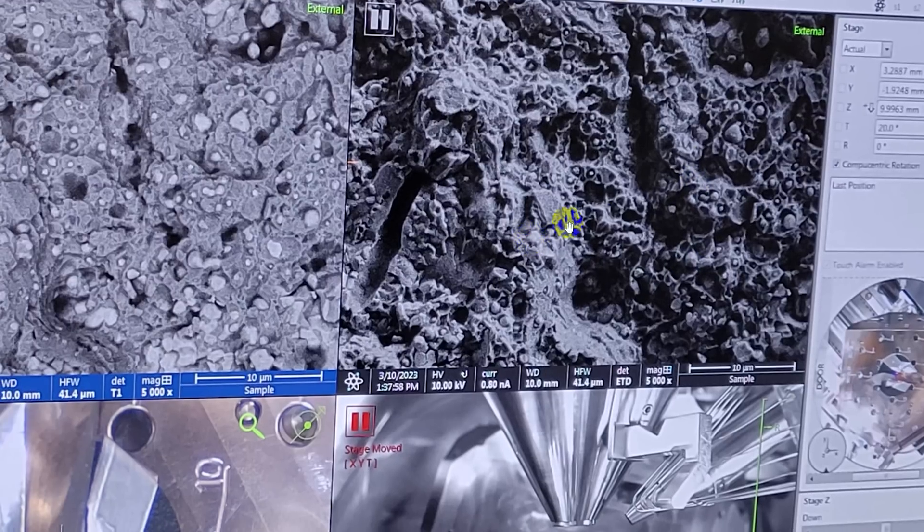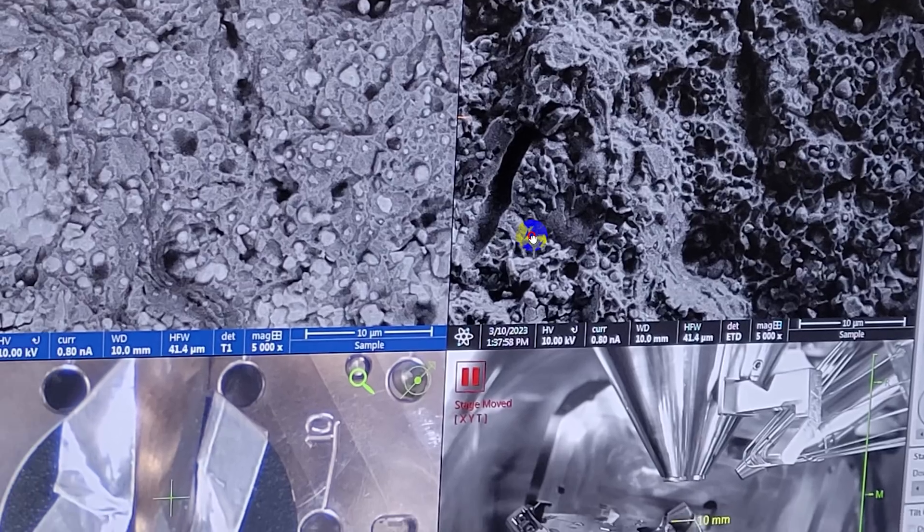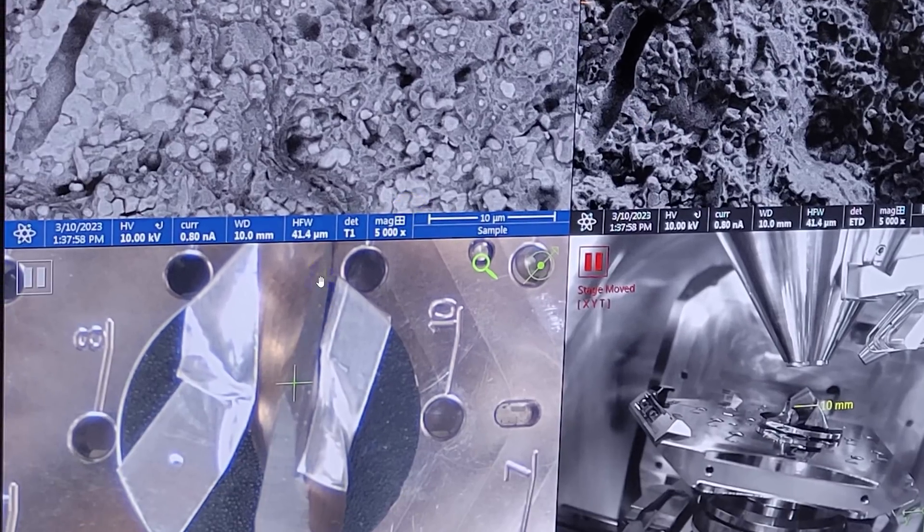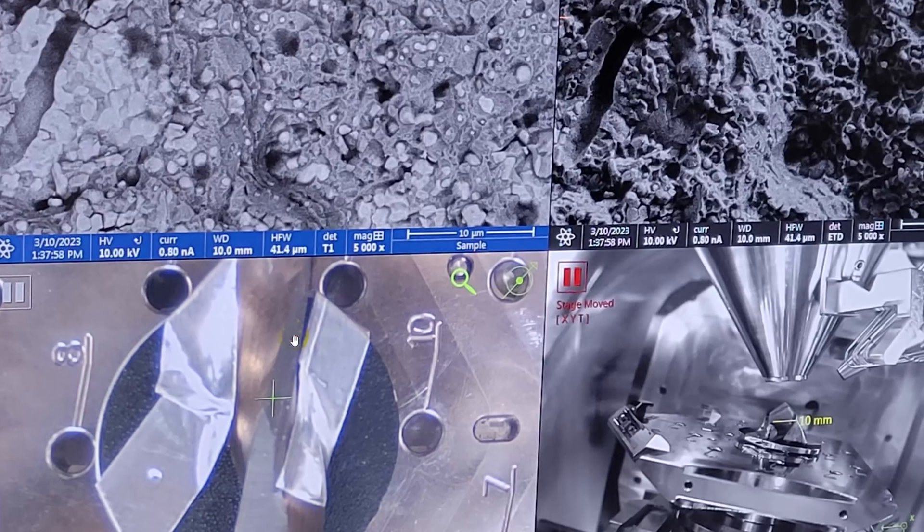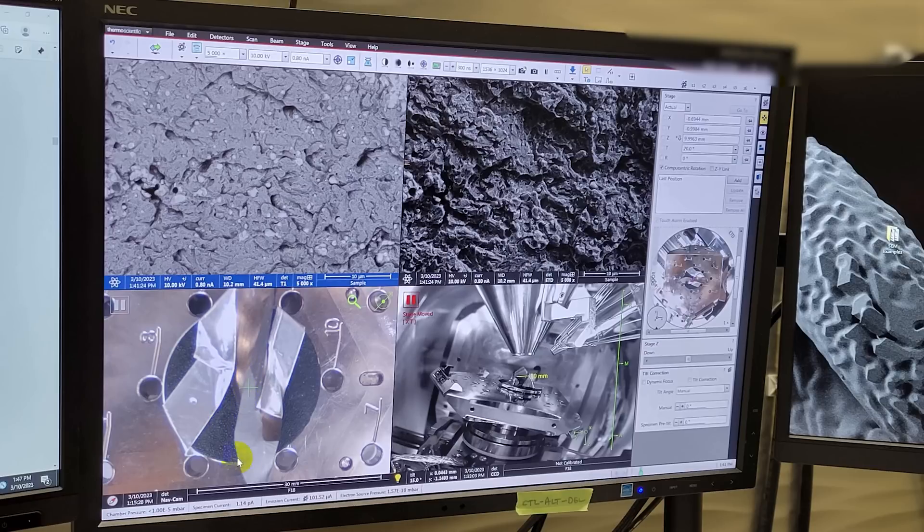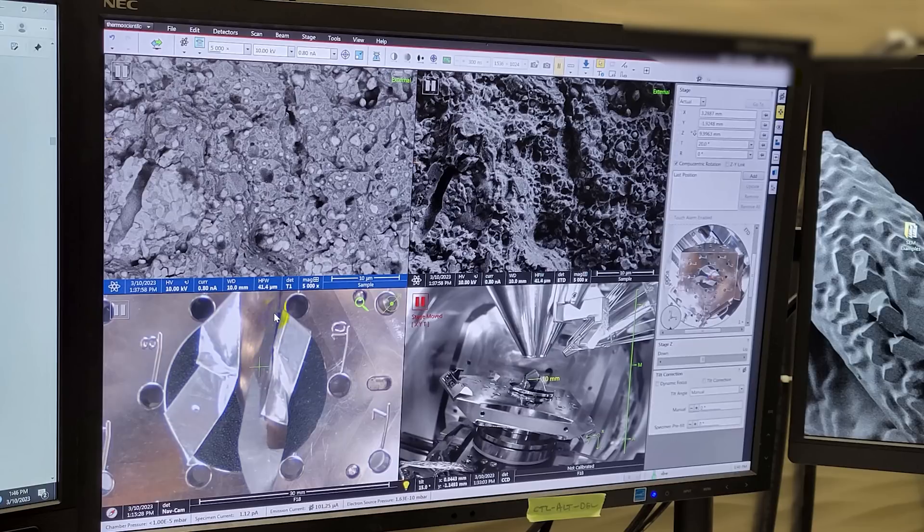This is characteristic of a ductile failure, which means that the material deformed before it finally broke. It kind of stretched and pulled away from these phases and then ultimately snapped off. That would be consistent with this occurring while the material was hot as a part of the manufacturing process, and that would be consistent with this cracking. I really don't know how the blanks for these drills are manufactured. I don't know how the heat treating process works, but this would be consistent with a crack forming during a forging process or during the heat treating process. So based on this analysis, I think the portion here that is light silver gray broke when the material was cold and the dark area of the break probably occurred when the material was hot and soft.